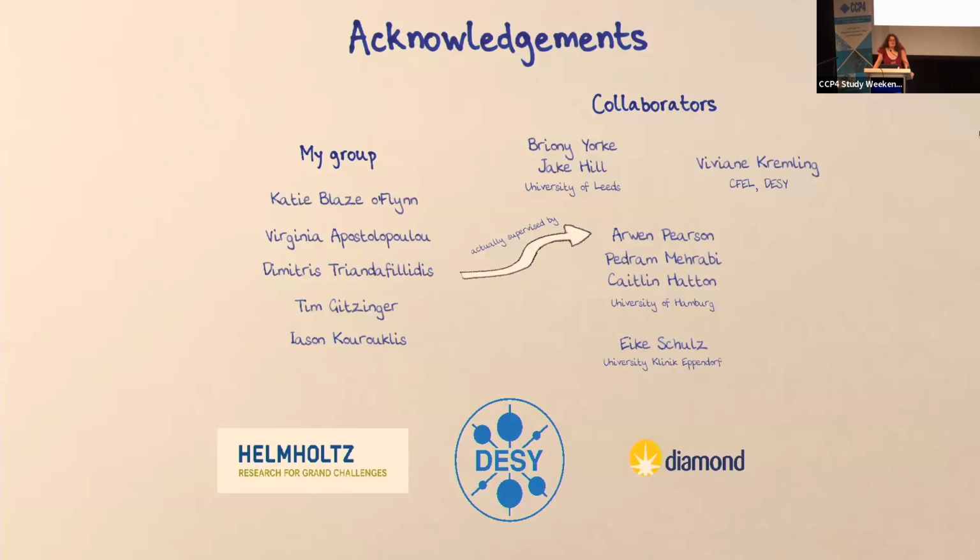When you showed the clusters, how do you decide whether you have 3, 5, or n clusters? Right, that decision isn't made by the software. It's replotting all of the values in PCA, but there's no k-means attempt to actually choose the clusters. You can do that by eye, or you can color by metadata or change the icon and so on. But it doesn't try to identify clusters for you.